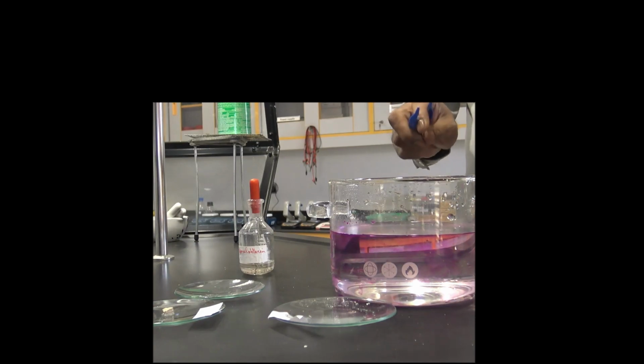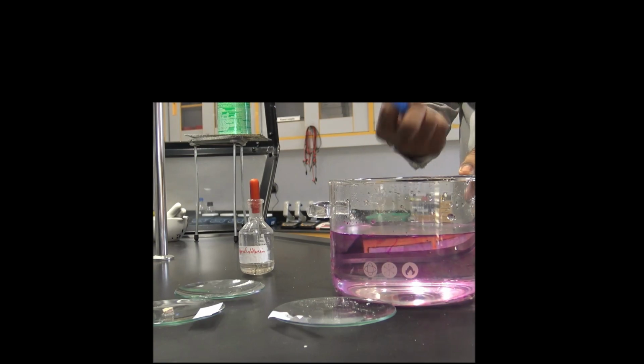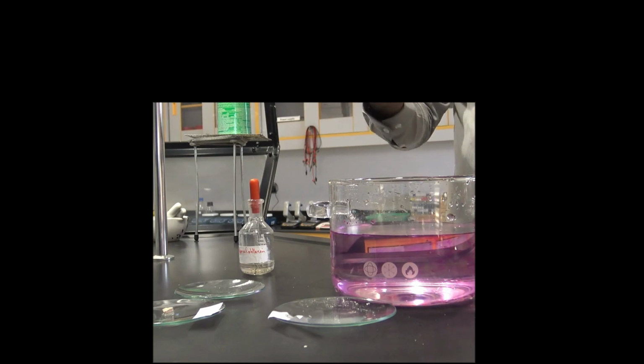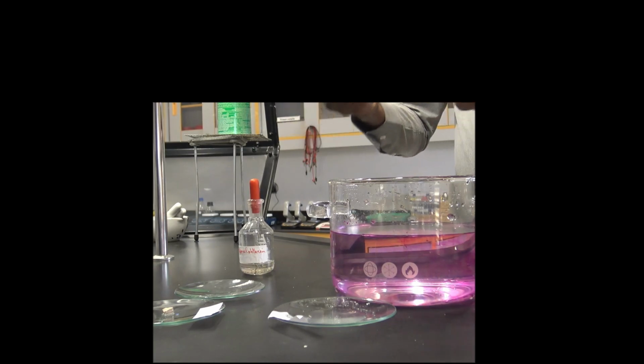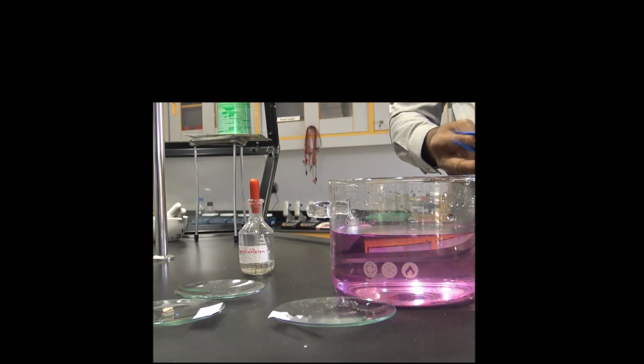We noticed a lilac flame as soon as I added it to water, which means potassium gives you a lilac flame. That's also linked with another part of chemistry where metals give different colors. Sodium gives a yellow color, potassium gives a lilac color, and every metal has different colors, which can be used for fireworks. So in the reactivity series, when we go down the group from lithium onwards, reactivity increases: the shells get bigger, the size gets bigger, and the number of electrons increases as well. Thank you.